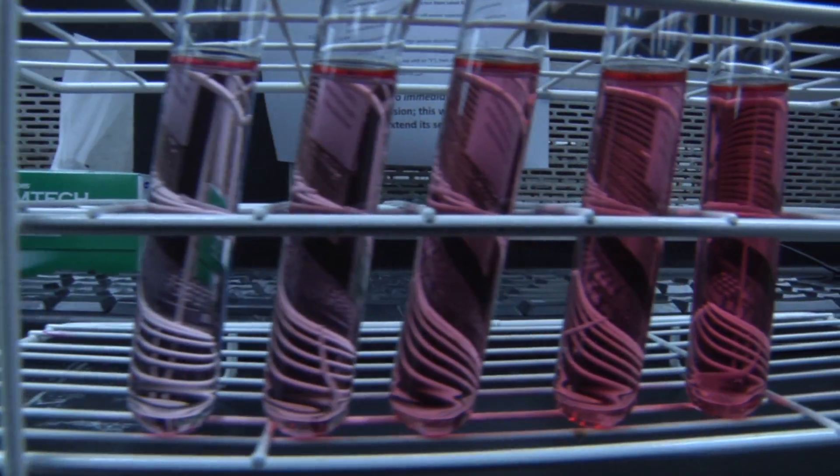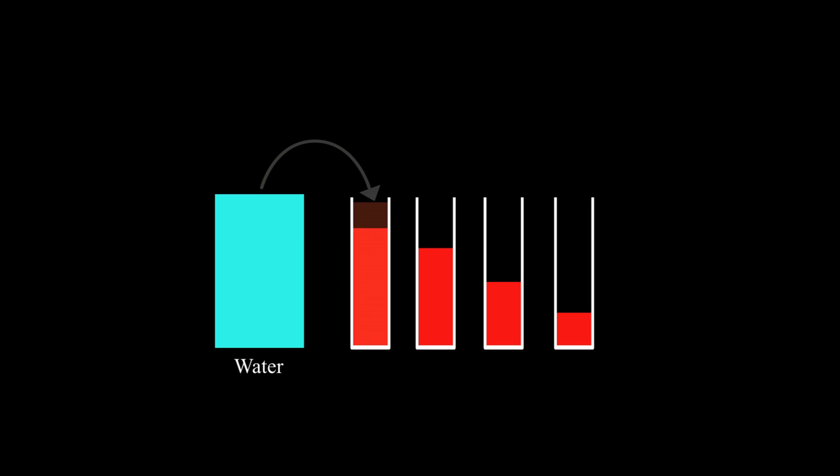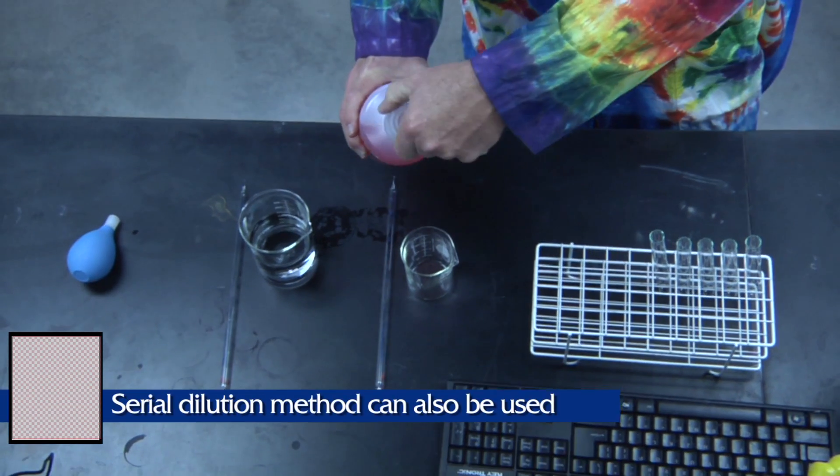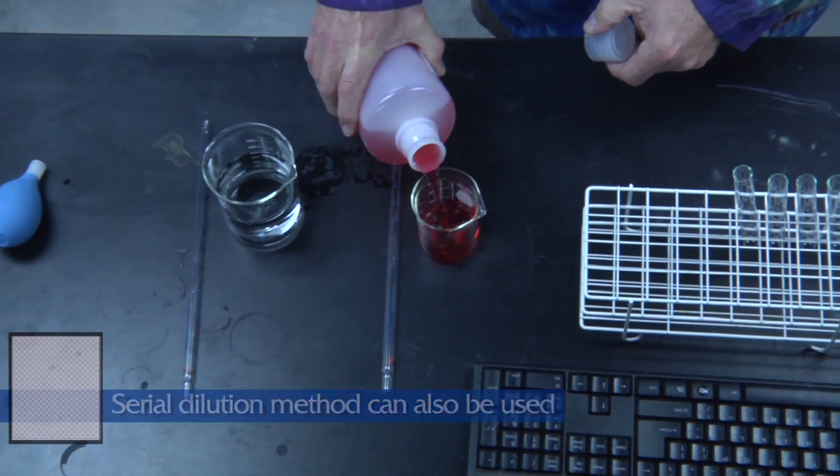Next you will need to prepare a series of solutions of known concentration. This is achieved by quantitatively diluting the stock solution. A parallel dilution will be illustrated here.